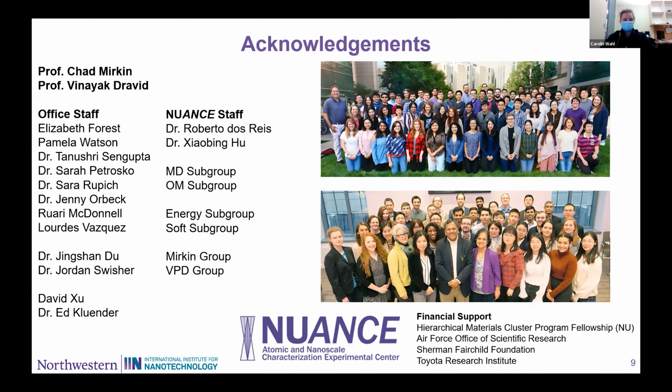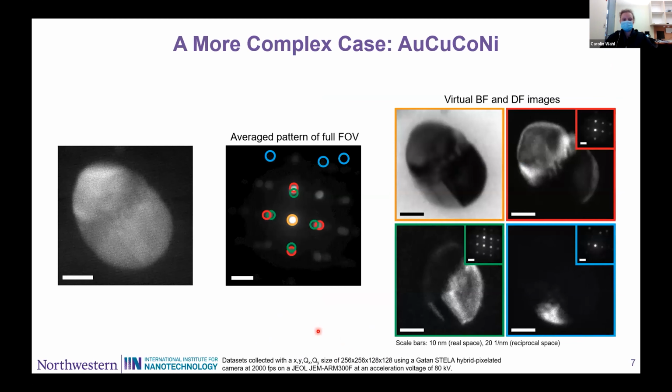Thank you very much, Carolin, for this wonderful talk. So I see one question in the chat for you. First is more of a comment: wonderful insights to multi-component materials, precise characterization. And the question is, in the gold, copper, cobalt, nickel compound, how accurate is using the lattice parameter to determine unary or binary phases?